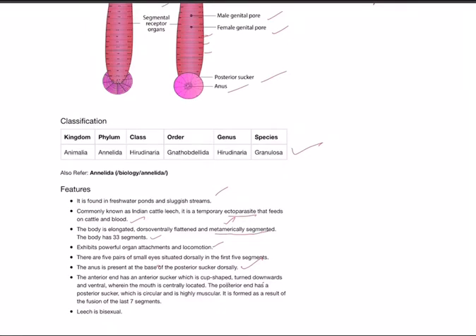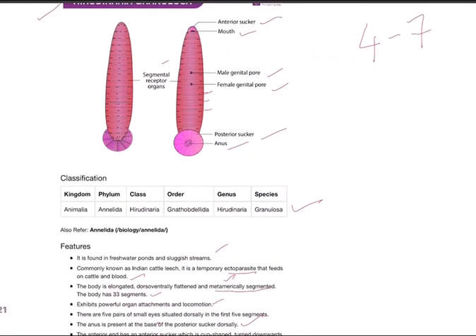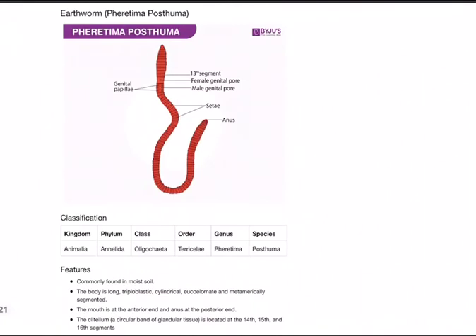The anus is present at the base of the posterior sucker dorsally. For any animal, remember there is a dorsal side, ventral side, anterior side, and posterior side. The anterior end has an anterior sucker which is cup-shaped, and the posterior end has a posterior sucker which is circular and highly muscular. It's formed by fusion of the last seven segments. Leech is bisexual.